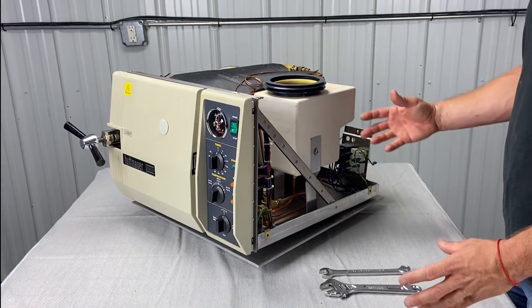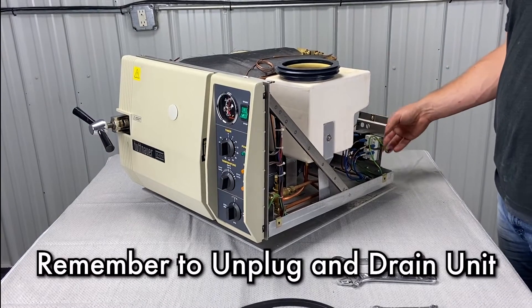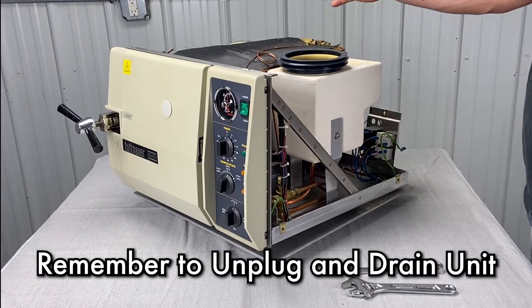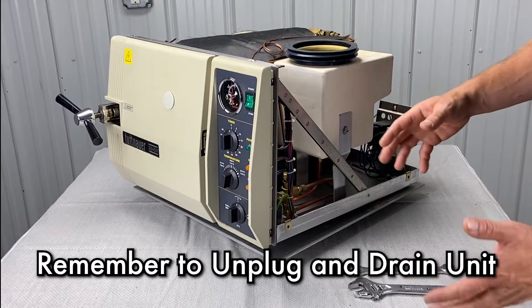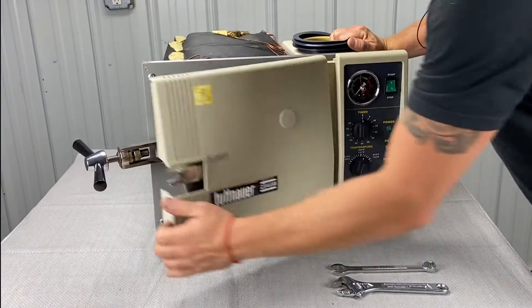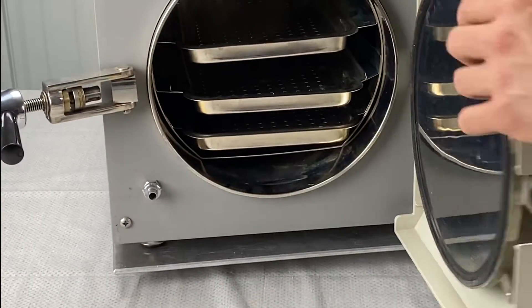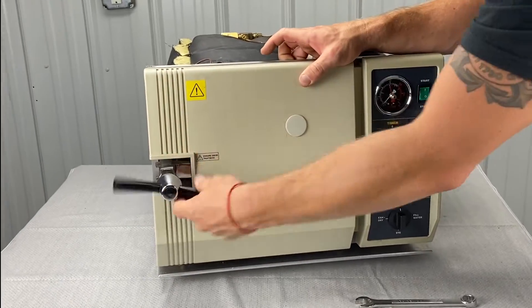First, we're going to remove the old parts. Two things you're going to want to do: unplug the unit from the back and the wall, and drain all the water out of the unit. To drain all the water, open the door — this is the drain right there. Just unscrew it and all the water will come out. I recommend doing that weekly also.